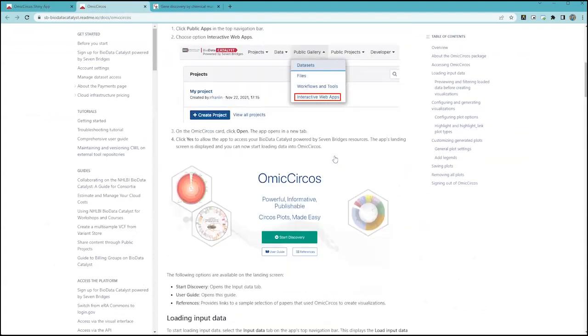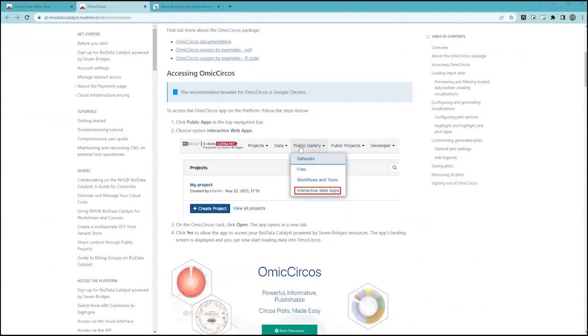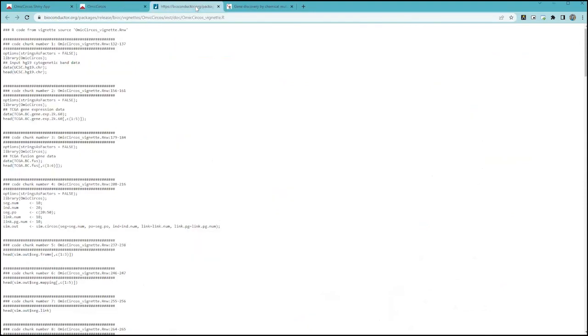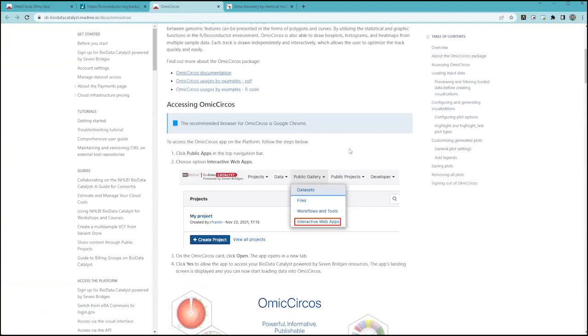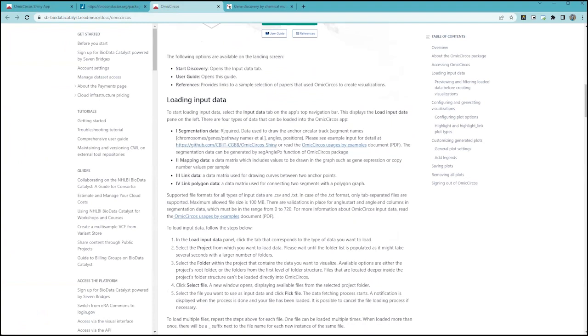Okay. So here, let me put this in the chat. Okay, so this is a vignette. So if you guys are familiar with that, I tried to follow this vignette, but using the Shiny app, and I didn't do so well. But this really tells you how each of the data sets, but to answer basically what using the example data set would be. But to answer your question, it should be in here. I'm not sure how we need to format it.